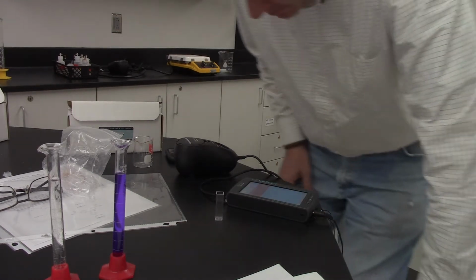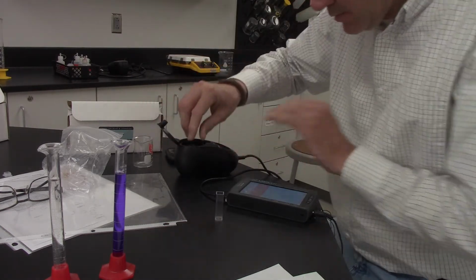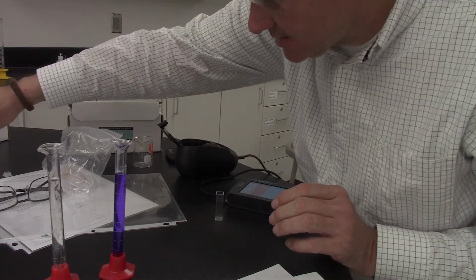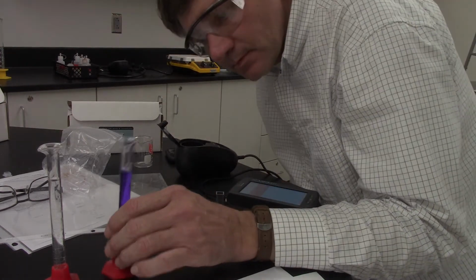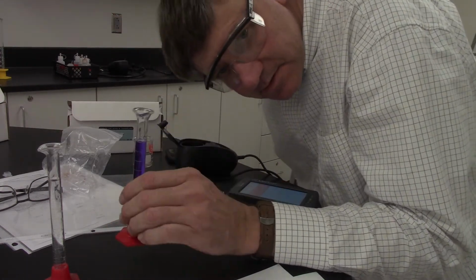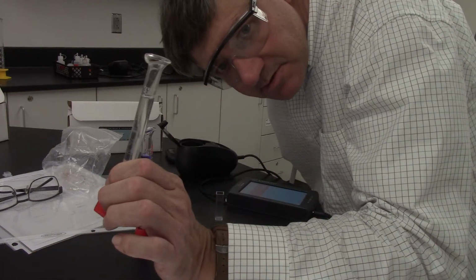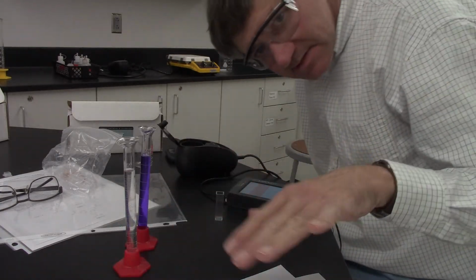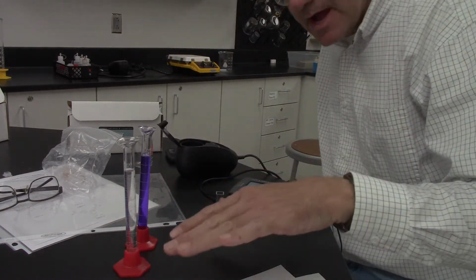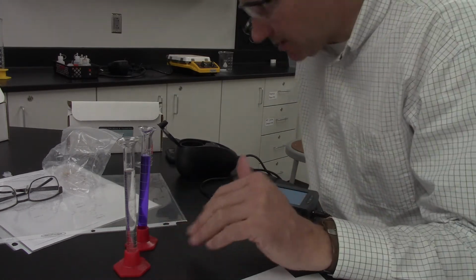Okay, so here's part 3. Now that we know how the setup is going to work, we're going to mix together 10 milliliters of the original stock solution and 10 milliliters of a 0.02 molar sodium hydroxide solution. When you get to the lab, you actually see the reaction that takes place. Basically, the sodium hydroxide reacts with the crystal violet and makes it colorless.